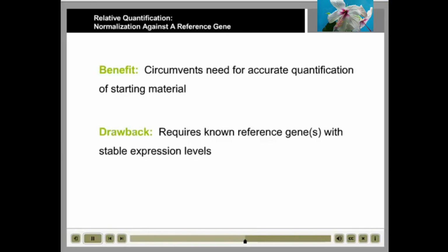The identification of such a gene is not trivial, and some have even proposed that, in most cases, the use of multiple reference genes may be necessary for accurate quantification.